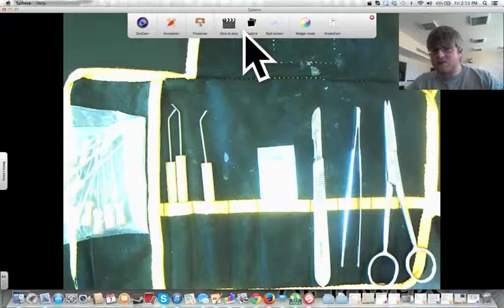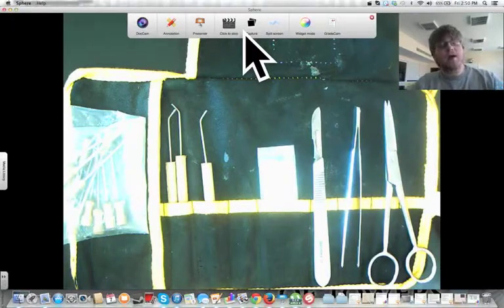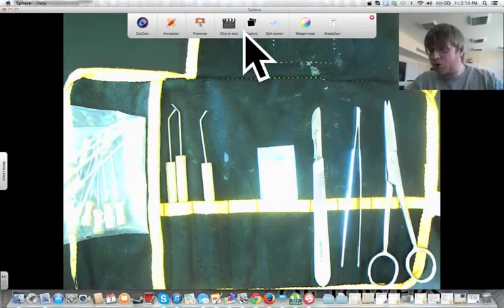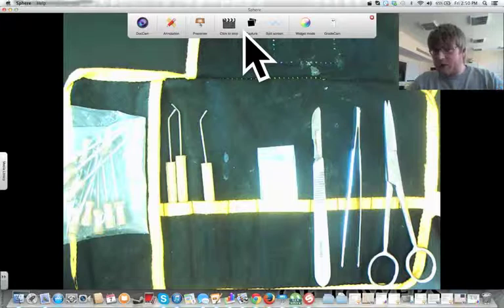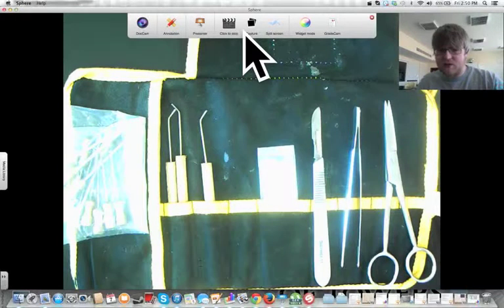Alright, this is Mr. Chris, and what I've got for you here today is a quick video on the different parts of a dissection kit, which you can see here beneath my head.